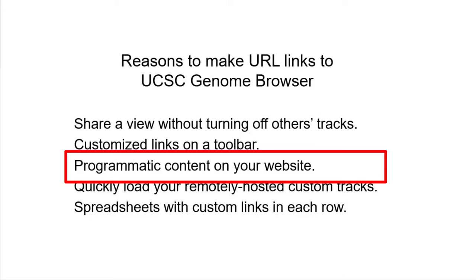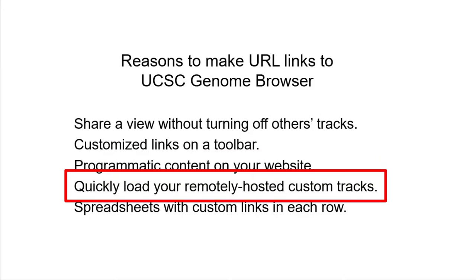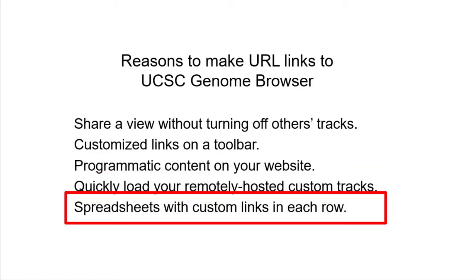You define the location, which datasets are turned on, and how they are configured. You may have custom tracks or a track hub on a server somewhere and you wish to easily load the data. Or you may have a spreadsheet with many rows of coordinates, gene names, or reference SNP identifiers. You can easily make a link that you copy down an entire column, creating custom links for each spreadsheet row.